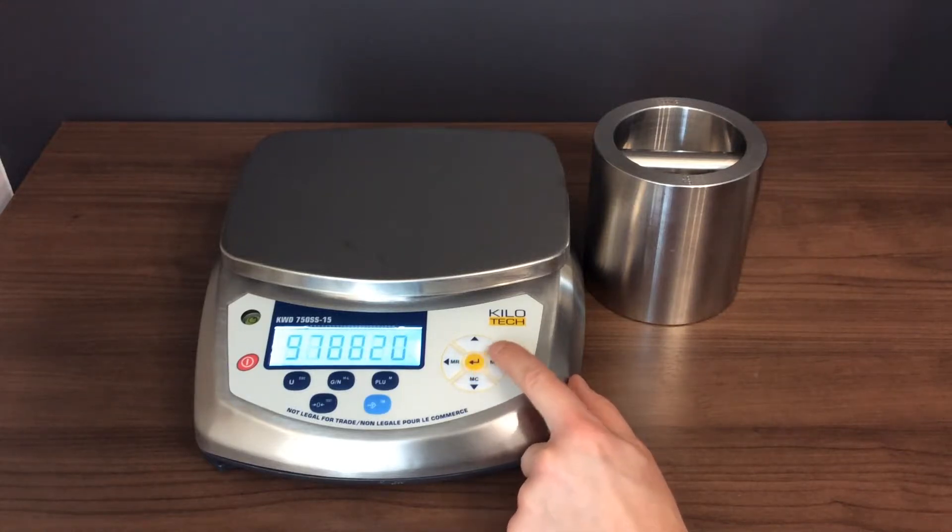Press ENTER. Using the arrow keys, set the scale to the six-digit value you wrote down earlier.